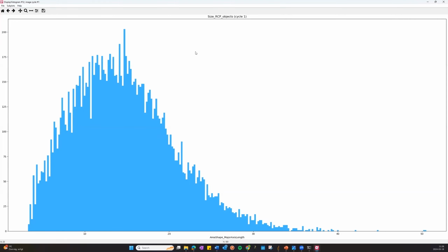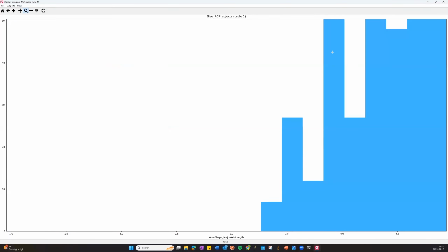So you will see then the smallest sizes and the largest sizes. And to get a closer look at the scale on the x-axis, you could, in any output window really, use this magnification glass, and you can highlight this area here. And then you can increase the magnification and you will see the x-axis here. So you can then decide on the smallest object in your image.